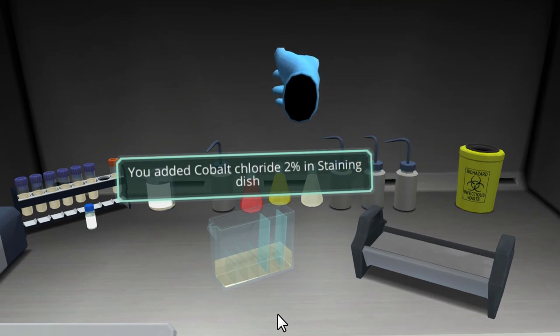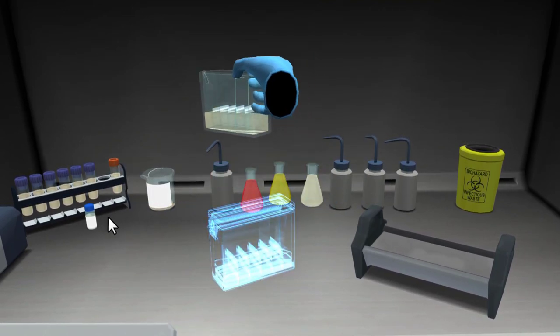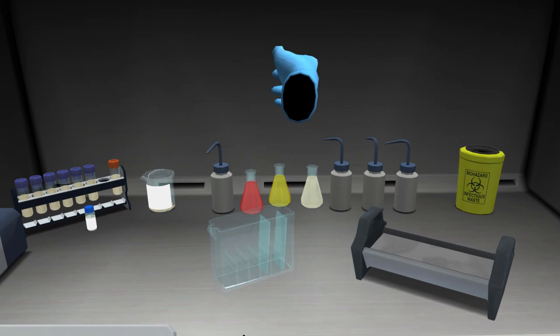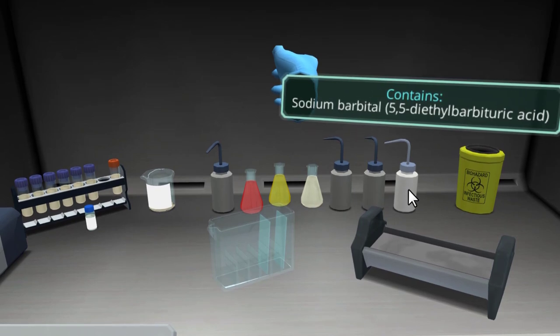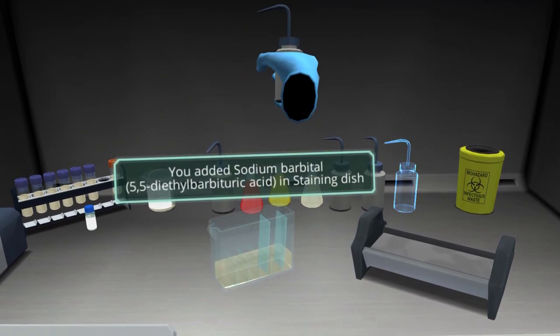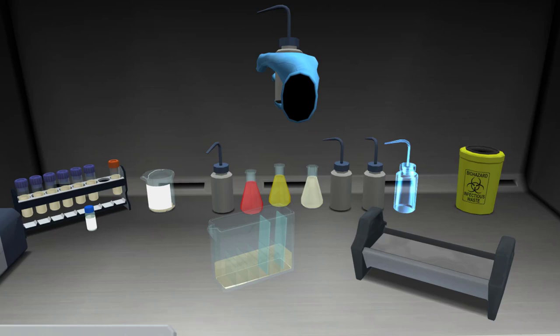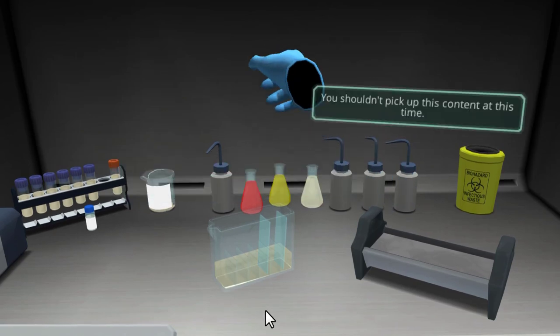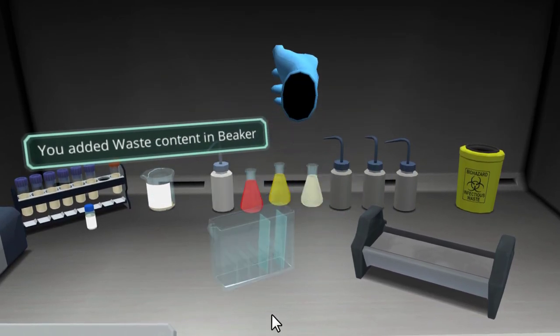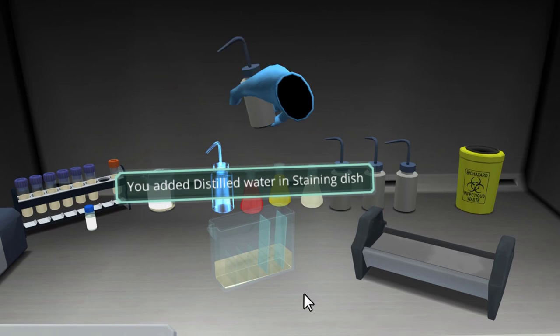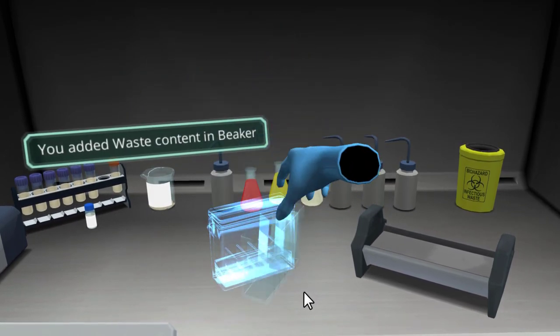10 minutes have passed so you can pour out the cobalt chloride. Now we want to wash with sodium barbitol three to five times each. You just do the first round, then I'll do the rest. Wash the samples once with sodium barbitol. I've finished the five washes. Now it's time for a final wash series in distilled water. You do it once, and then I will complete another four times. Click on the bottle of distilled water to wash the slides.